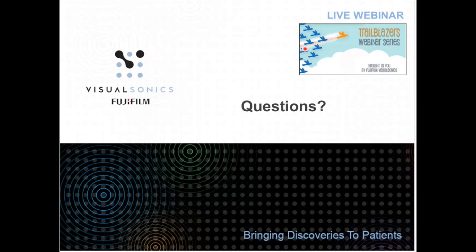I think it's probably important to add too, you showed a workflow through the software that identified the ability to characterize in vitro. There's nothing really preventing you from doing such a characterization in vivo. And if you had a very well-defined assay at a particular depth where you knew there was agent located, you could potentially create characteristic curves to unmix based on that information.